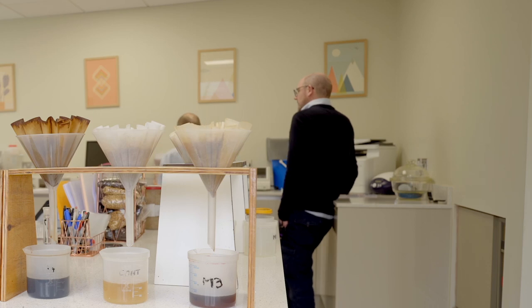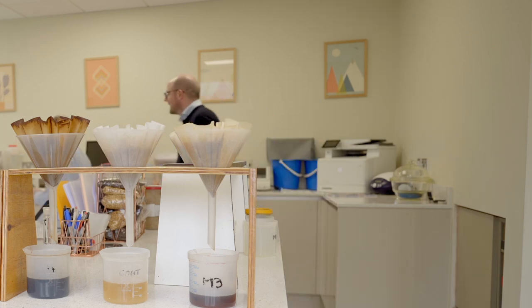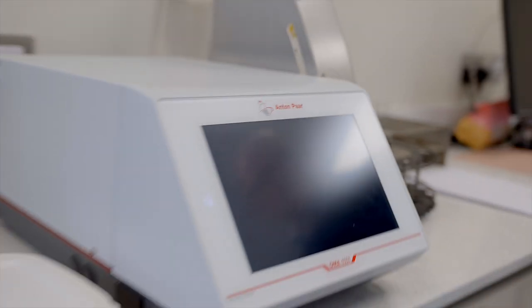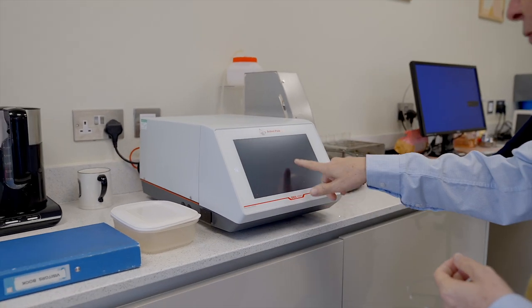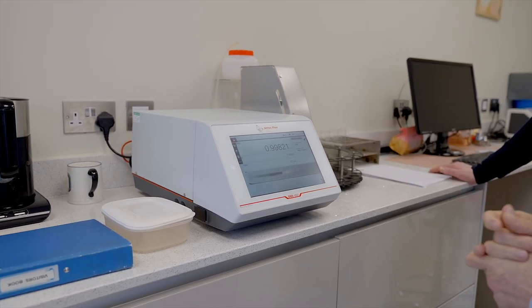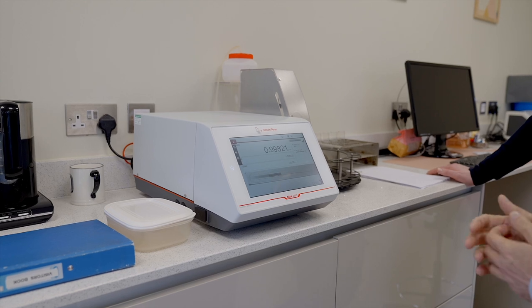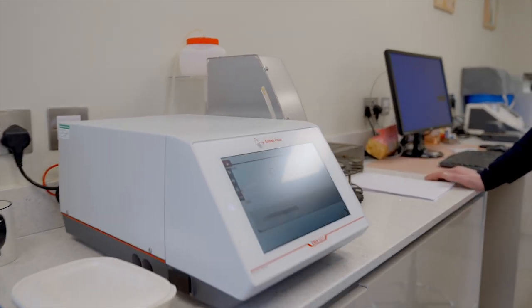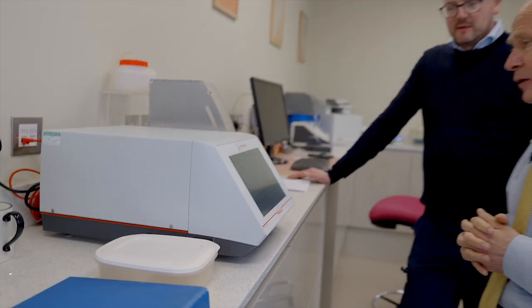What is this fancy Anton Paar then? This is a density meter, and that will give you the density and specific gravity of the malts we put through. Depending on what samples you put through, it can also tell you the percentage of alcohol in there as well.